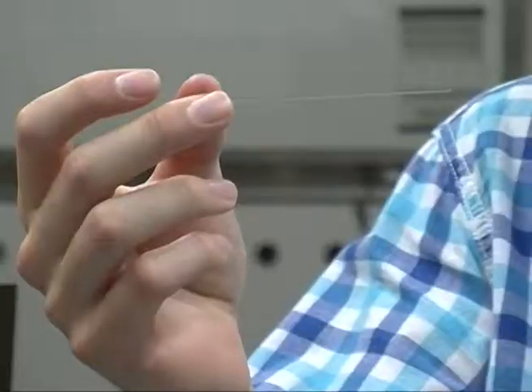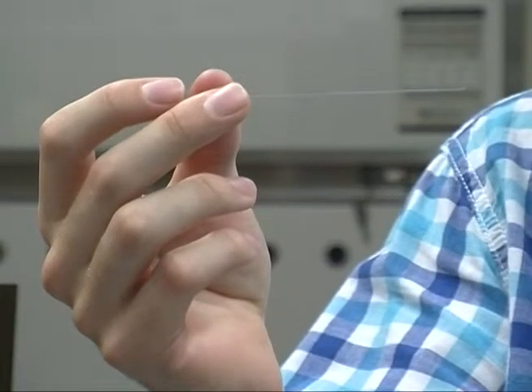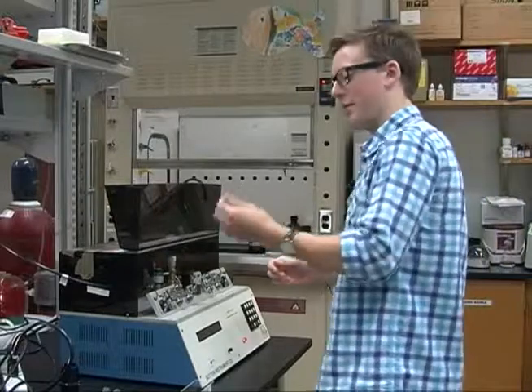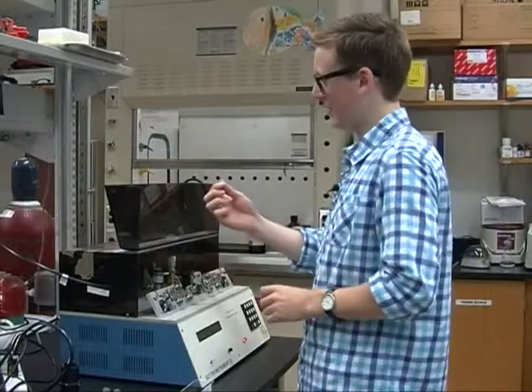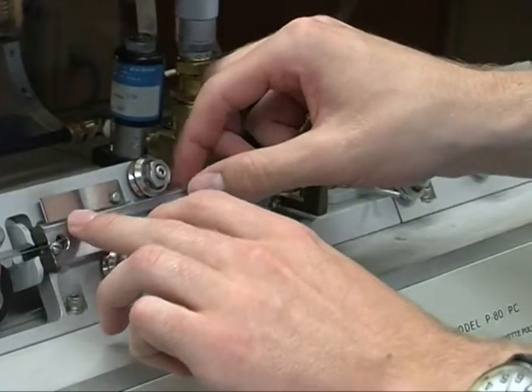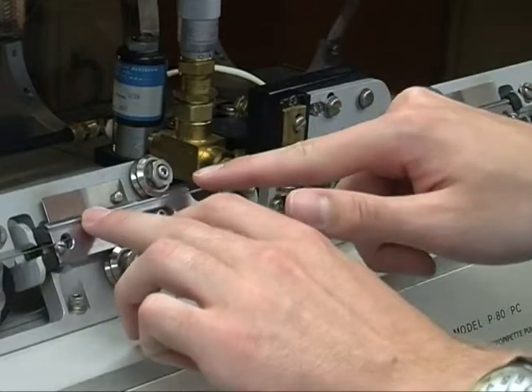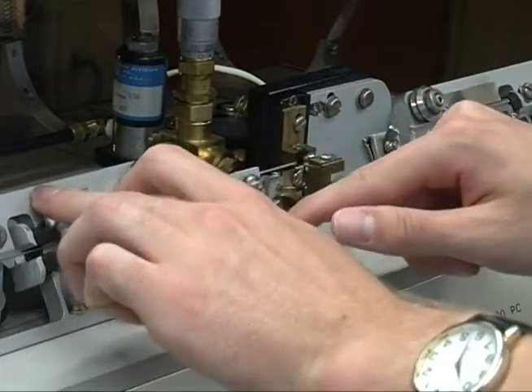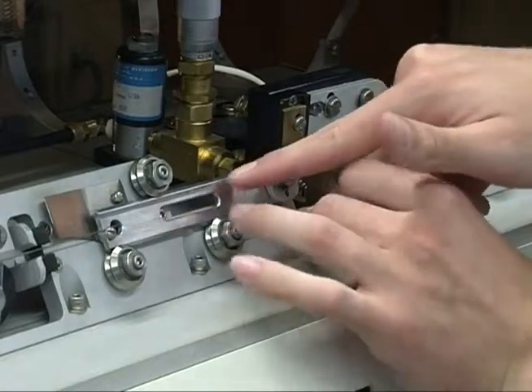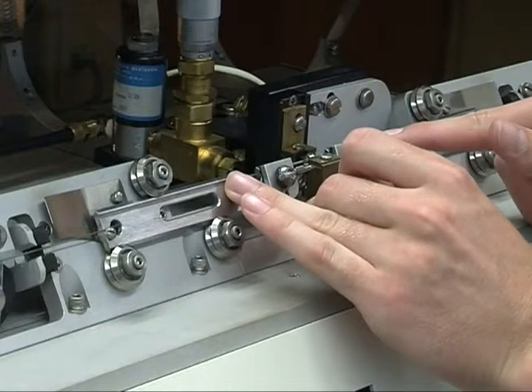It's basically a fine glass needle that gets pulled apart to a very, very fine point, which then we clip, and we use that to inject the embryos. So what we have is a glass tube. It's not quite a needle yet. We put it into the puller, and the trick is to push it in between this filament.